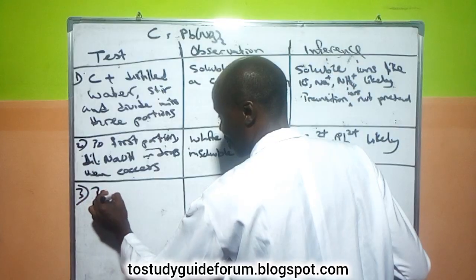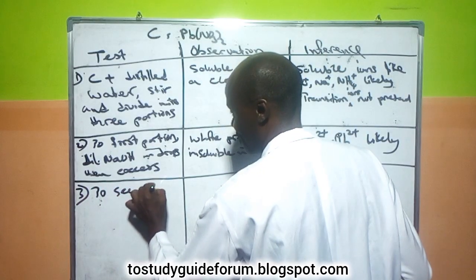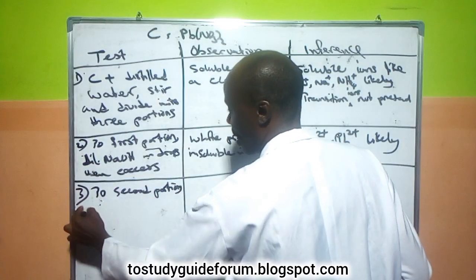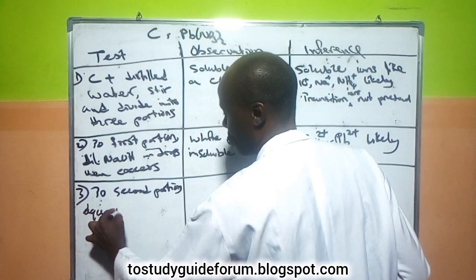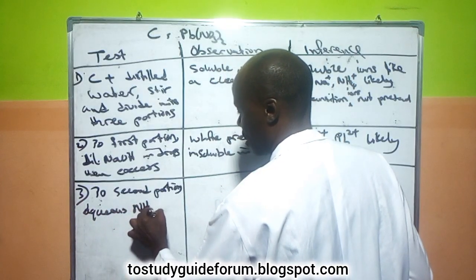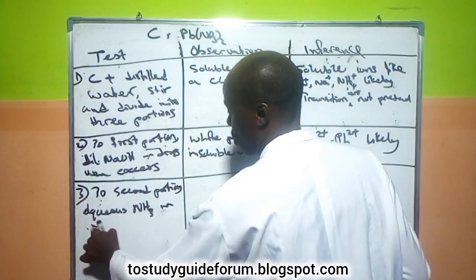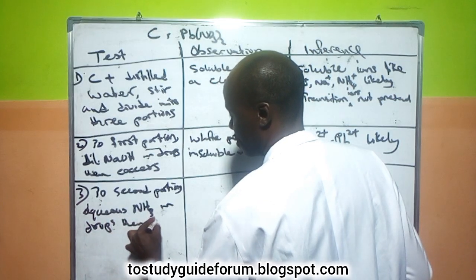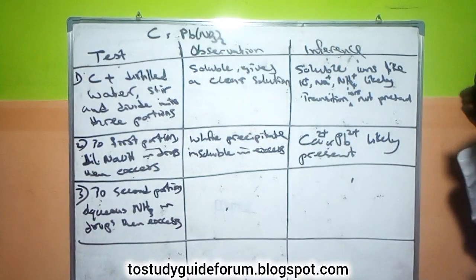The next question, the second portion, we add aqueous ammonia in drops, then in excess.